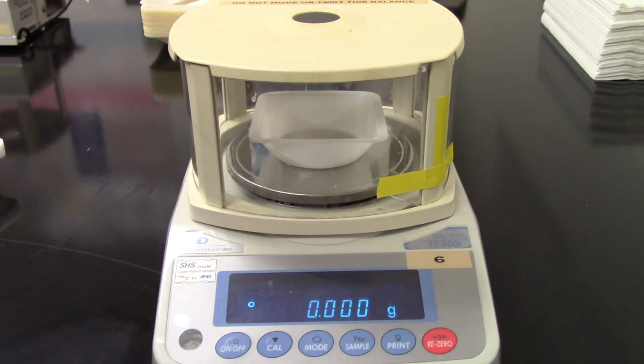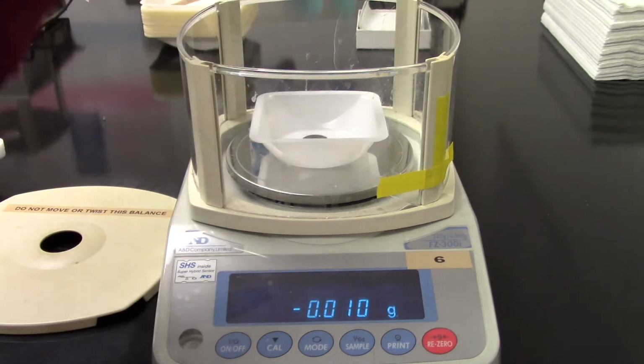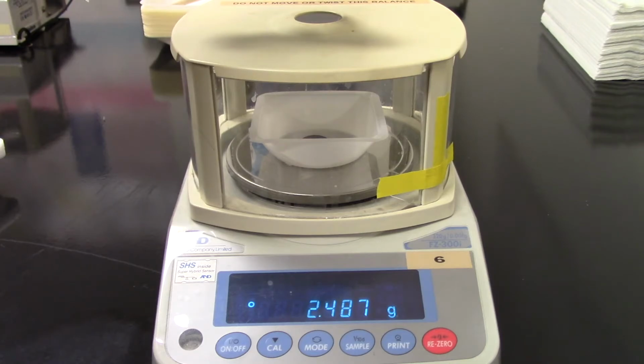All right, now I'm going to read out the year of the penny. You're going to want to write down the year and the mass in your data sheet. This penny is 1993. Let me put the cover back on. And there's your mass.